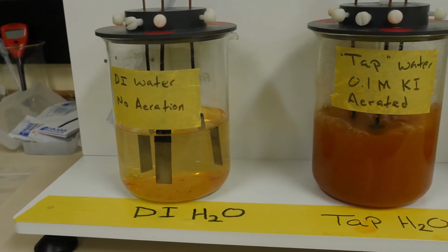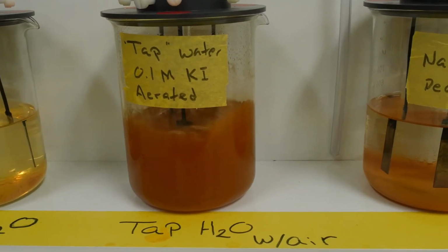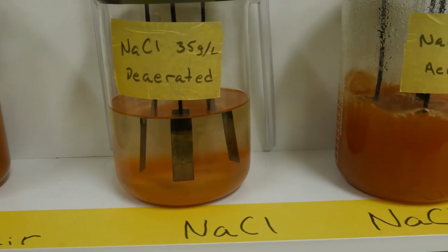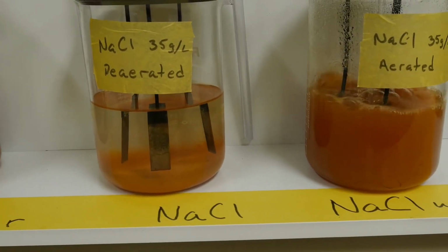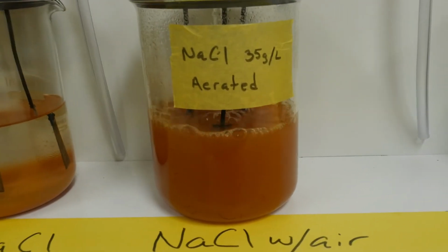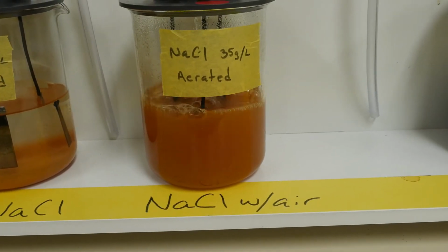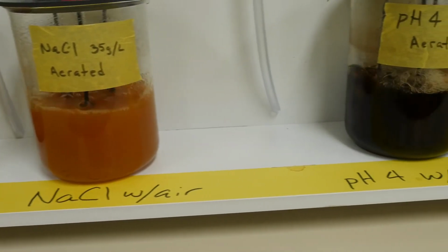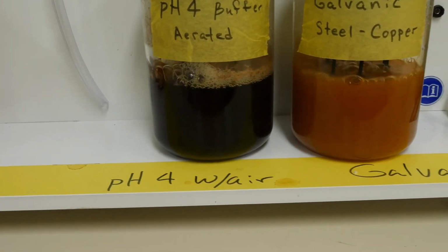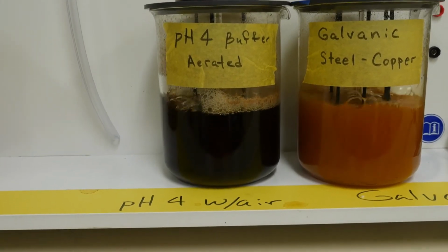The electrolyte solutions in the corrosion cells are, from left to right, deionized water, 0.1 molar potassium iodide solution, which is used as a stand-in for tap water, deoxygenated sodium chloride solution at 35 grams per liter, which is similar to seawater, an aerated sodium chloride solution of the same concentration, a buffer solution of pH 4, which is representative of a dilute acidic environment, and lastly, a galvanic cell with 0.1 molar potassium iodide solution and galvanic couples formed from mild steel and copper.